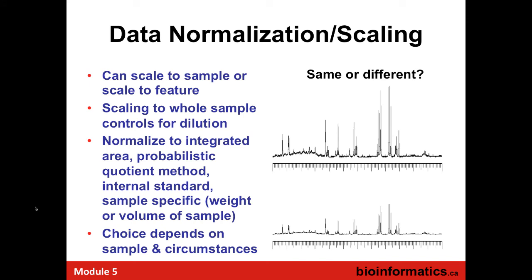Another thing that Jeff mentioned comes into the field of what we call data normalization, scaling, centering, and transformation. It's really confusing, I think, for everyone, because the same words mean different things to different people. I'll apologize right now because sometimes I will slip into talking about normalizing when it's also sort of scaling or transforming. So normalization in the world of physics and math often means adjusting things so that they have a minimum and a maximum between 0 and 1 or 0 and 100. But that can also be called scaling. Again, you just adjust things so that everything is on a different unit of measurement.